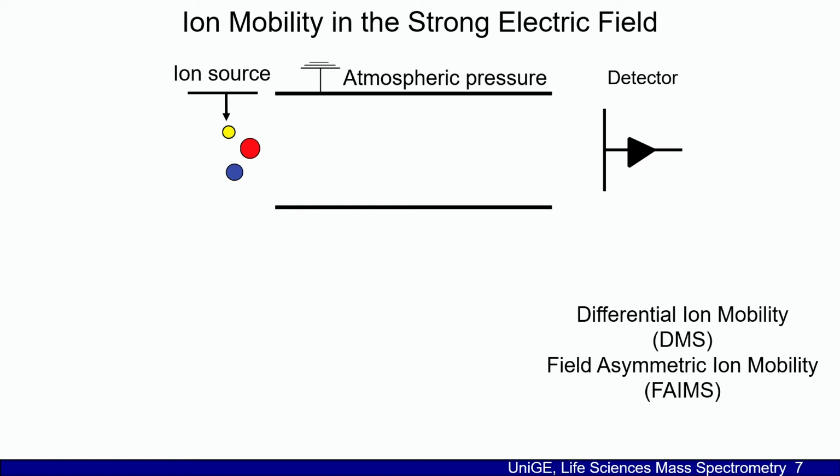We've seen in the previous session about FAIMS that was implemented by Thermo, which has circular geometry, and SCIEX is using differential ion mobility with planar electrodes. So the principle is the following. These two parallel plates, typically a 1 millimeter gap and 1 centimeter long, sit in between the ion source and detector.